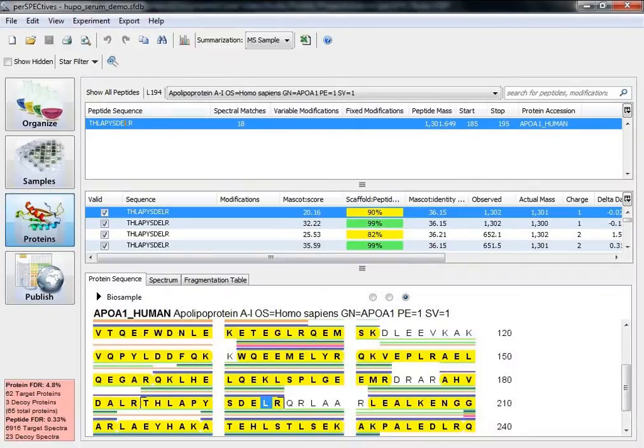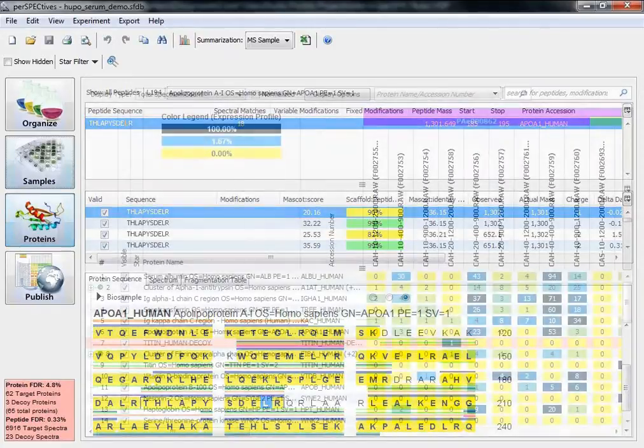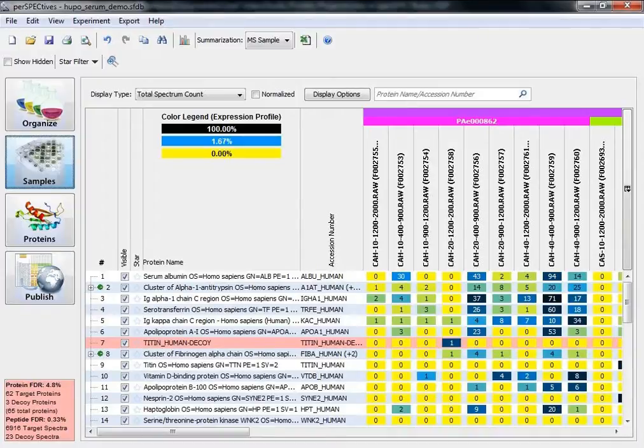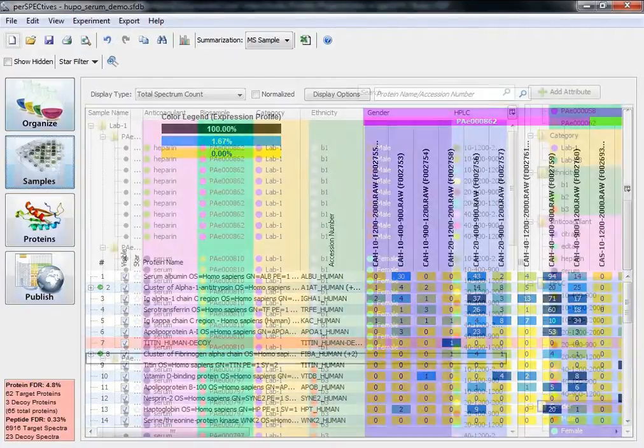Scaffold Perspectives is a high-volume processing tool that Proteum Software has designed to give its users more control over the organization of their experiment. With Perspectives, users will see detailed explorations of the data with sophisticated color schemes.